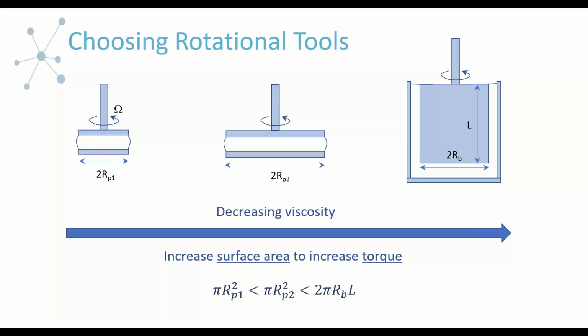And there is the analogous operational window for the torque for the rotational instruments. I'm not going to give numbers here because I'm speaking very generally, since that torque operating window will vary depending on the specific manufacturer and model of your rotational rheometer. So I'm not going to be giving numbers like Zach did. But that is the analogy here.